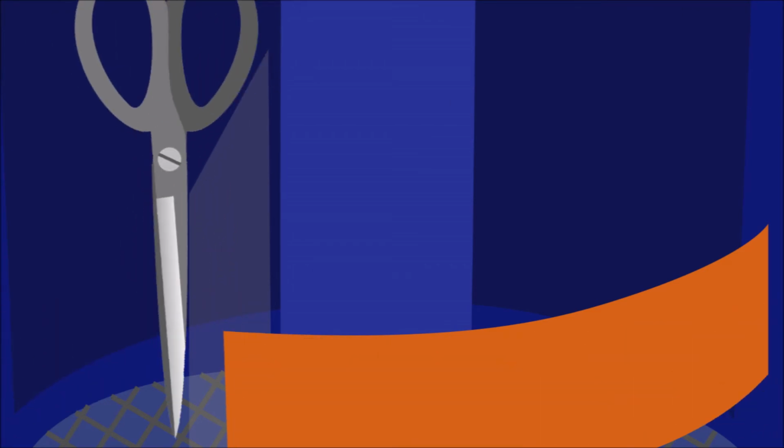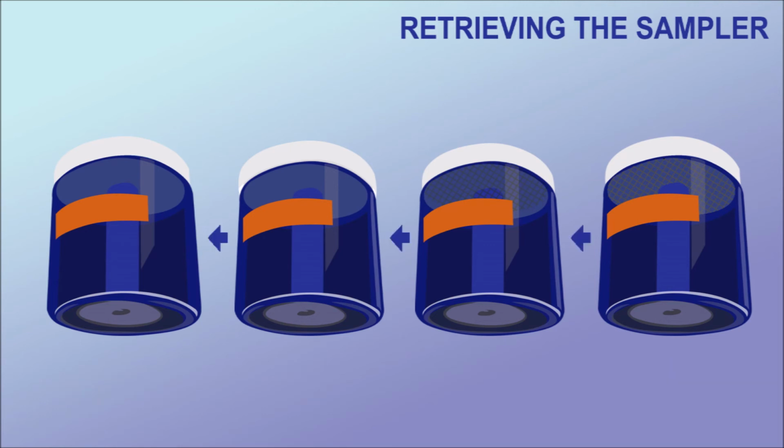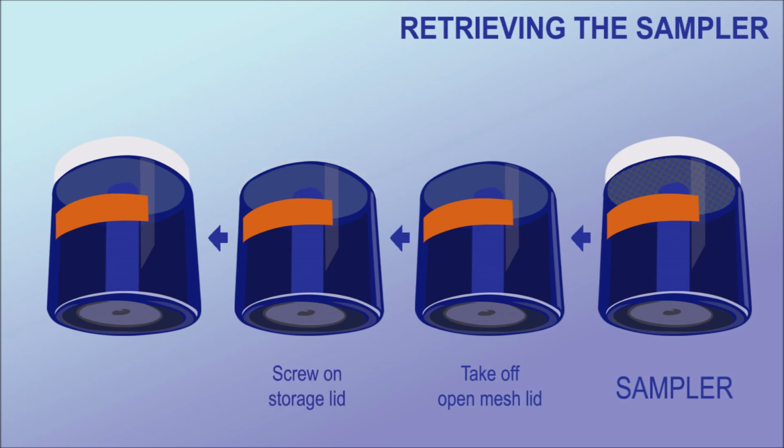To retrieve the sampler, first cut it loose by cutting the cable ties. Be careful not to damage the blue housing. The next part of the procedure is just like the sampler preparation procedure, but backwards. We will replace the mesh lid with the storage lid. Remove the mesh lid. Now, screw on a storage lid and tighten the lid extremely tight.